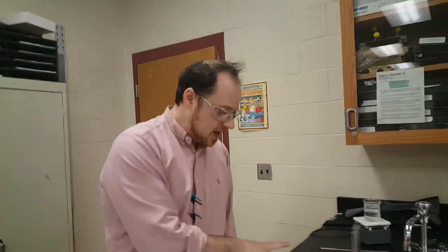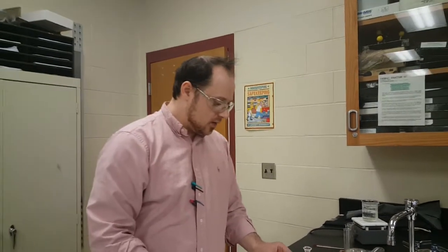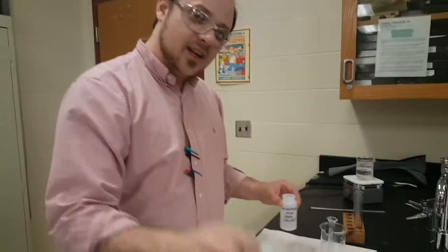And what are we going to change? The concentration of the acid. How do you think we're going to do that, Mr. Milks? Well, I want to make it more concentrated to make it go faster, personally. Can't do it. We can't make this any more concentrated. We got to make it more dilute. Oh, okay. That'll work, though, right? So adding water should make the reaction what, then? Well, you'll find out. I'm not giving it away. Oh, good catch. I was seeing if I could catch you. Water is going to help us dilute it.